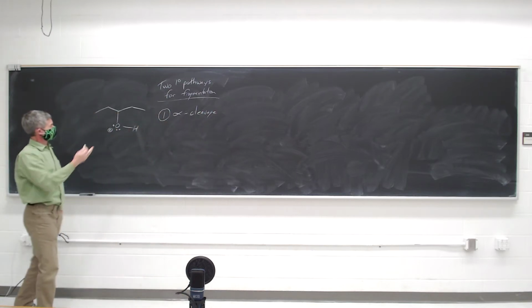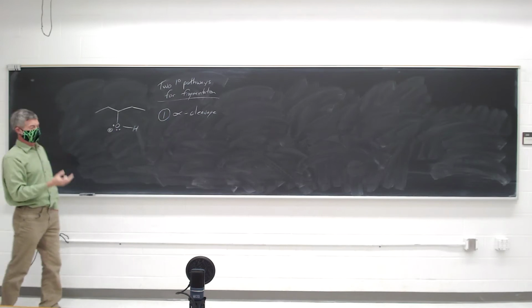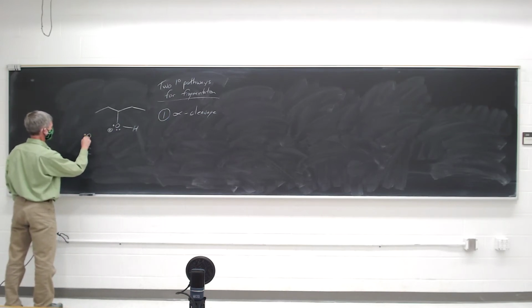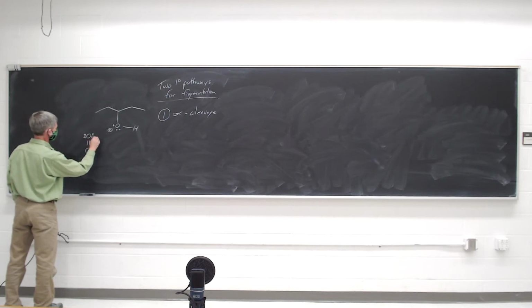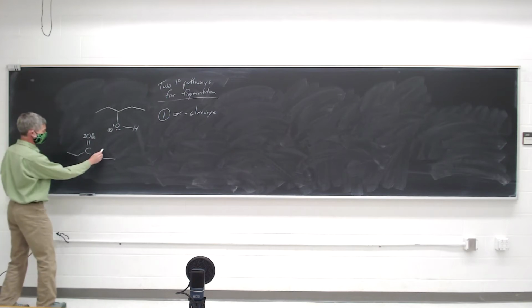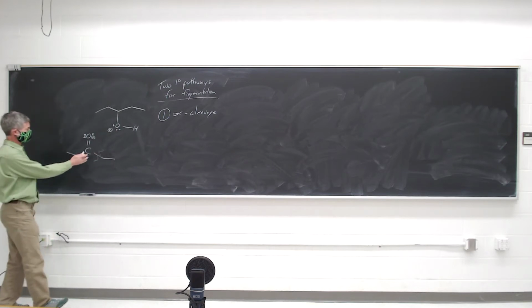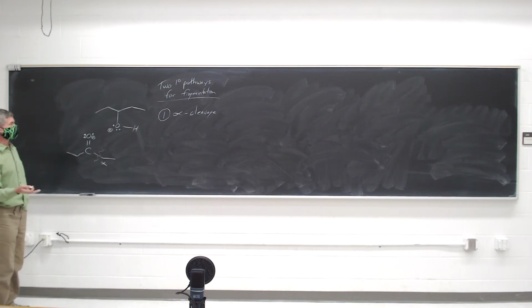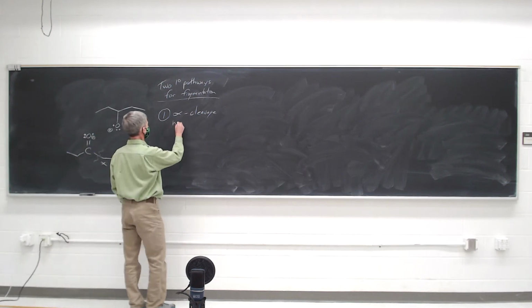This name actually comes from carbonyl compounds. If you have a carbonyl compound, and you make a radical cation here, for example, it is very common for it to fragment here between the carbonyl carbon and the alpha carbon, and that's where the name alpha cleavage comes from. Alpha cleavage is a homolytic bond cleavage.